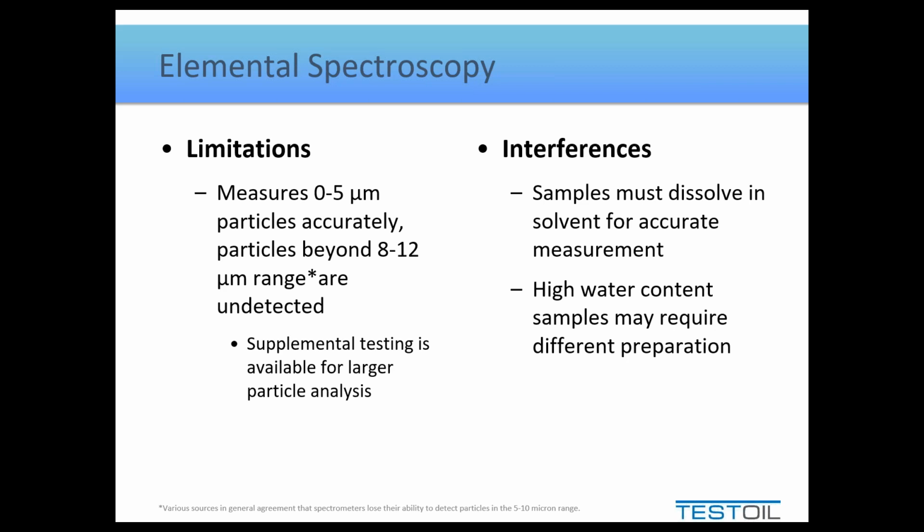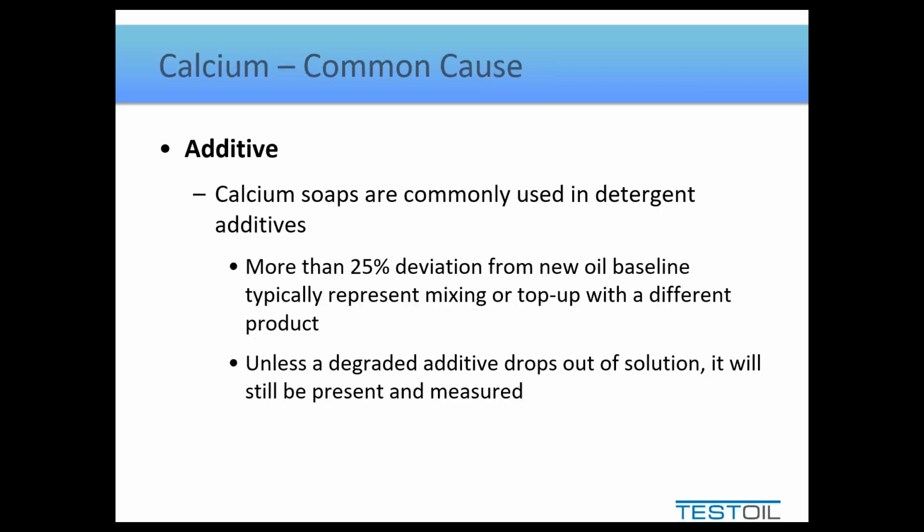But just to cover a couple of the parameters measured by this test, let me point out the first of two, calcium.